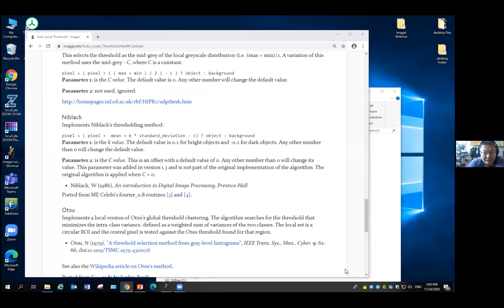But again, to reduce the noise, the best way is when you take the picture, you take a better picture with less noise. Any noise reduction on the digital image side always blurs your image, which reduces the resolution.